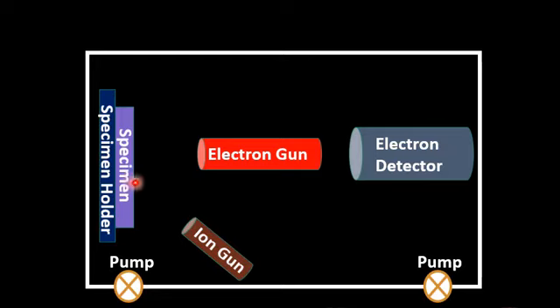After that, beneath the layer or beneath the broken part of the sample surface, Auger electron spectroscopy is done to understand the chemical composition of the material beneath the layer of the sample. So basically this ion gun is very important in Auger electron spectroscope. First, the ion gun removes any kind of contamination on the sample surface. The second role of the ion gun is to do the depth profiling of the sample.